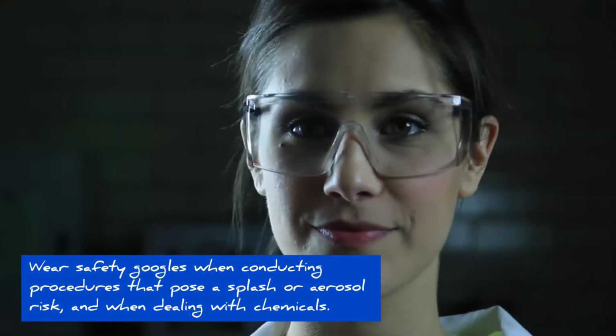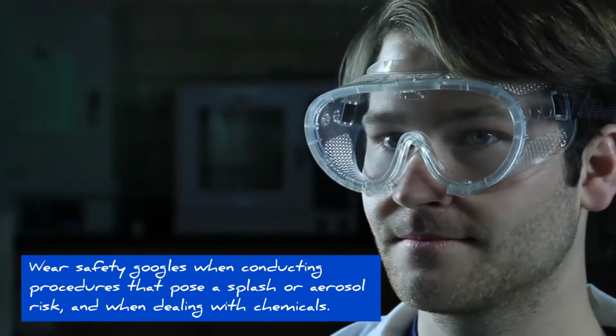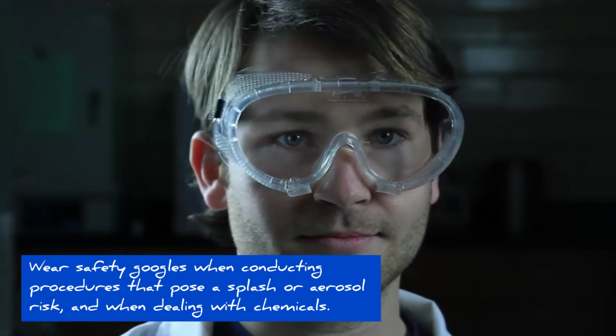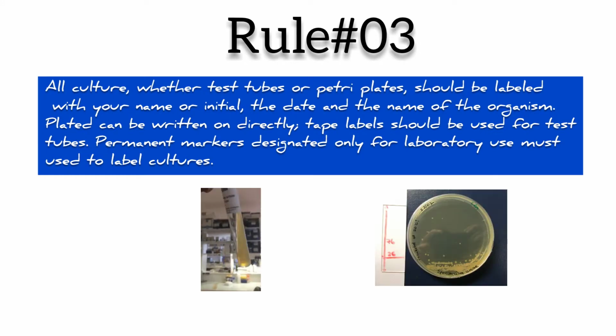Wear safety goggles when conducting procedures that pose a splash or aerosol risk, and when dealing with certain chemicals such as staining reagents. All cultures, whether test tubes or petri plates, should be labeled with your name or initials, the date and the name of the organism. Petri plates can be written on directly. Tape labels should be used for test tubes. A permanent marker designated only for laboratory use must be used to label cultures.